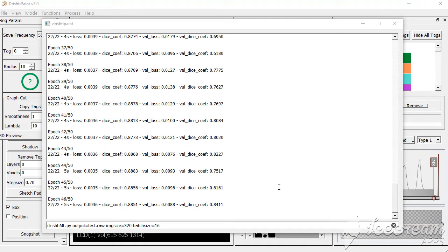I've now resumed the recording. So you can see the validation is around 83%. It's now close to 50 epochs.